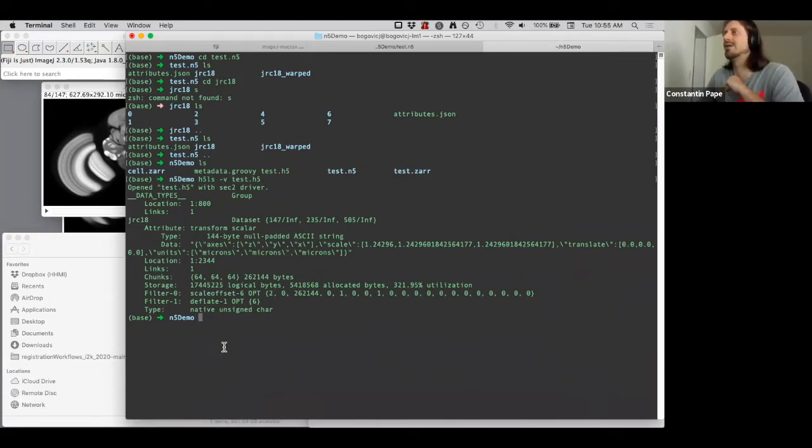But on the other hand, I also wouldn't see it as such a big issue to copy out, or move out, some of the metadata into the arrays. It's rather a bit more tricky how these decisions get made right now. But there is a pretty long GitHub discussion about exactly this topic opened by Davis.